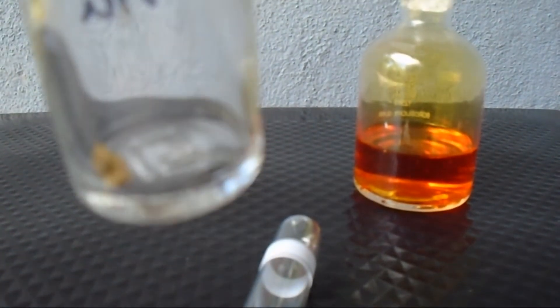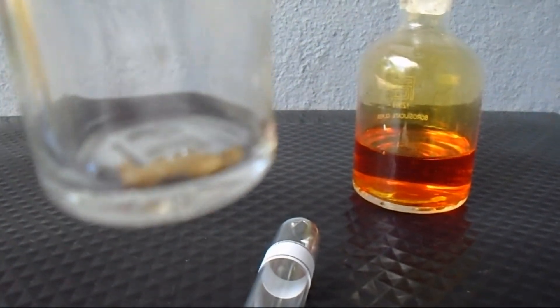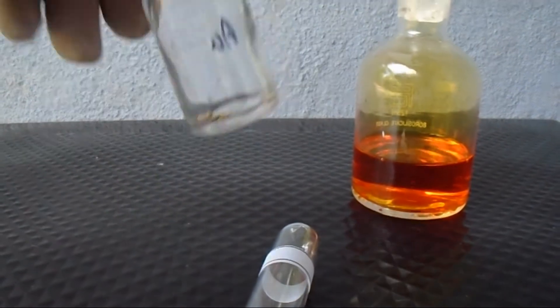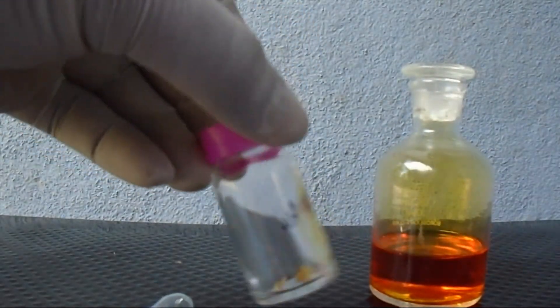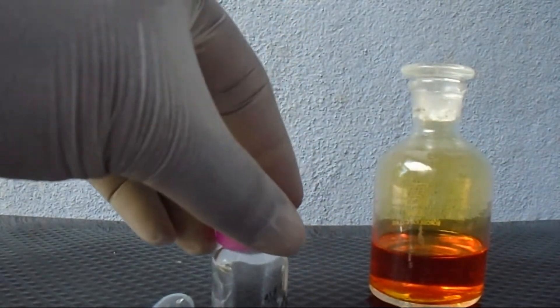Here it is — in this bottle I have some 22 karat gold metal. Now I am going to dissolve these gold metal pieces in aqua regia solution.